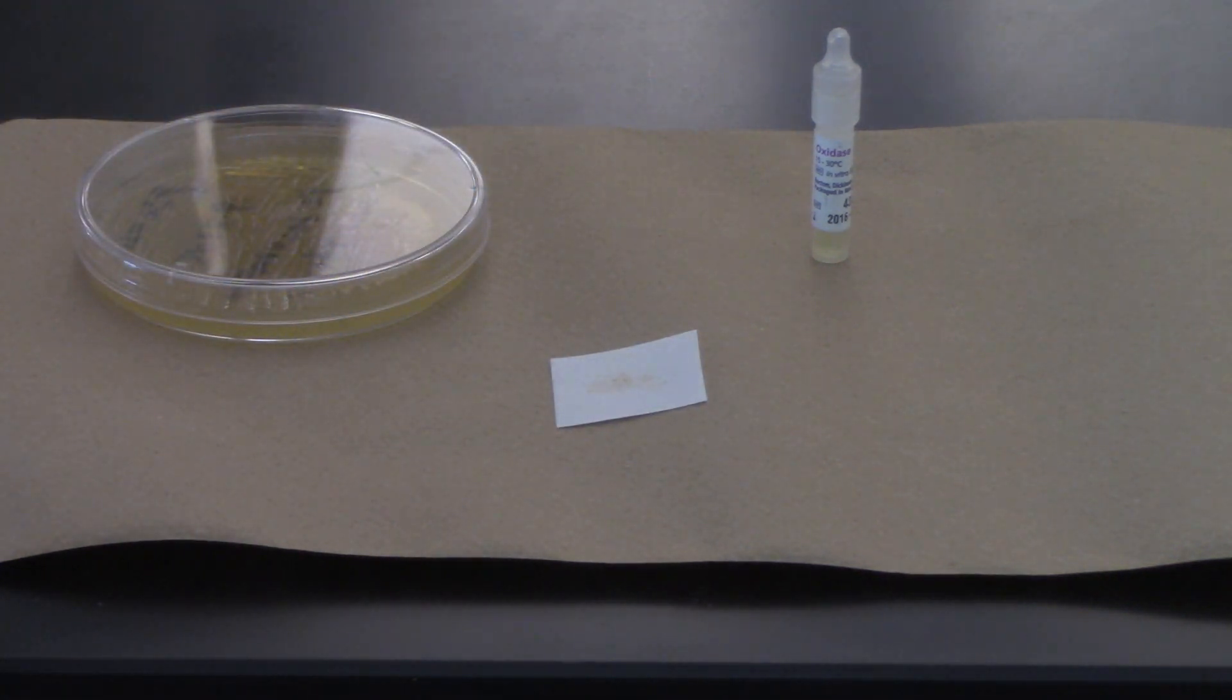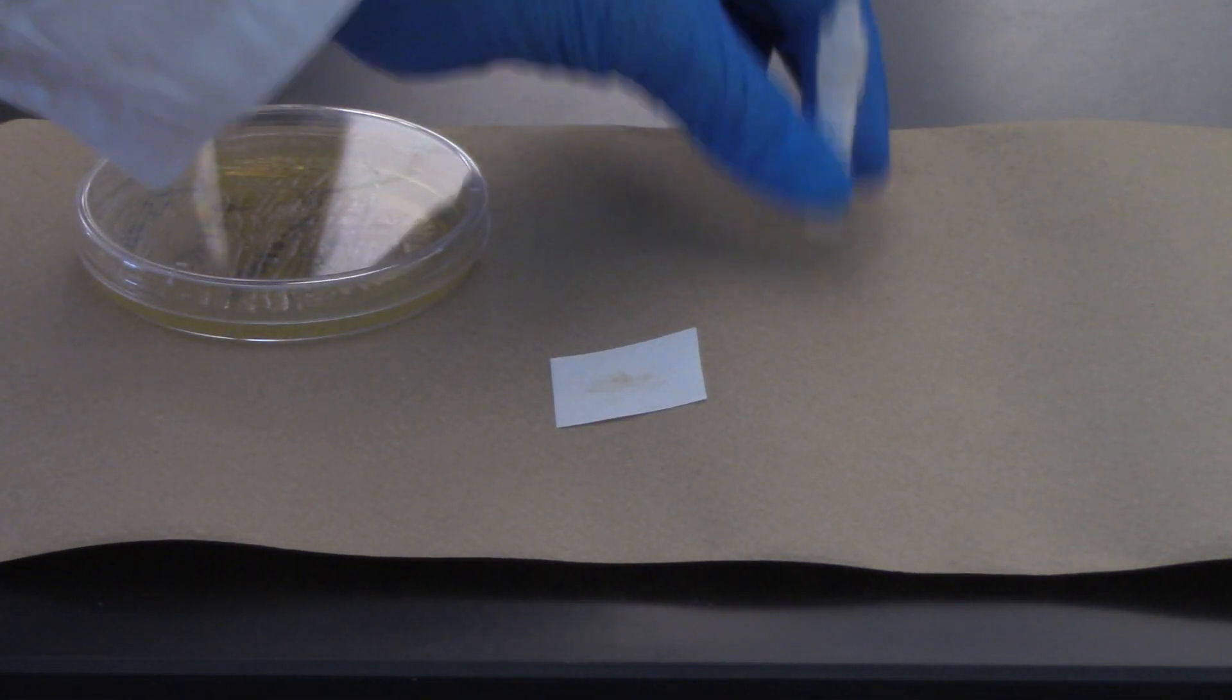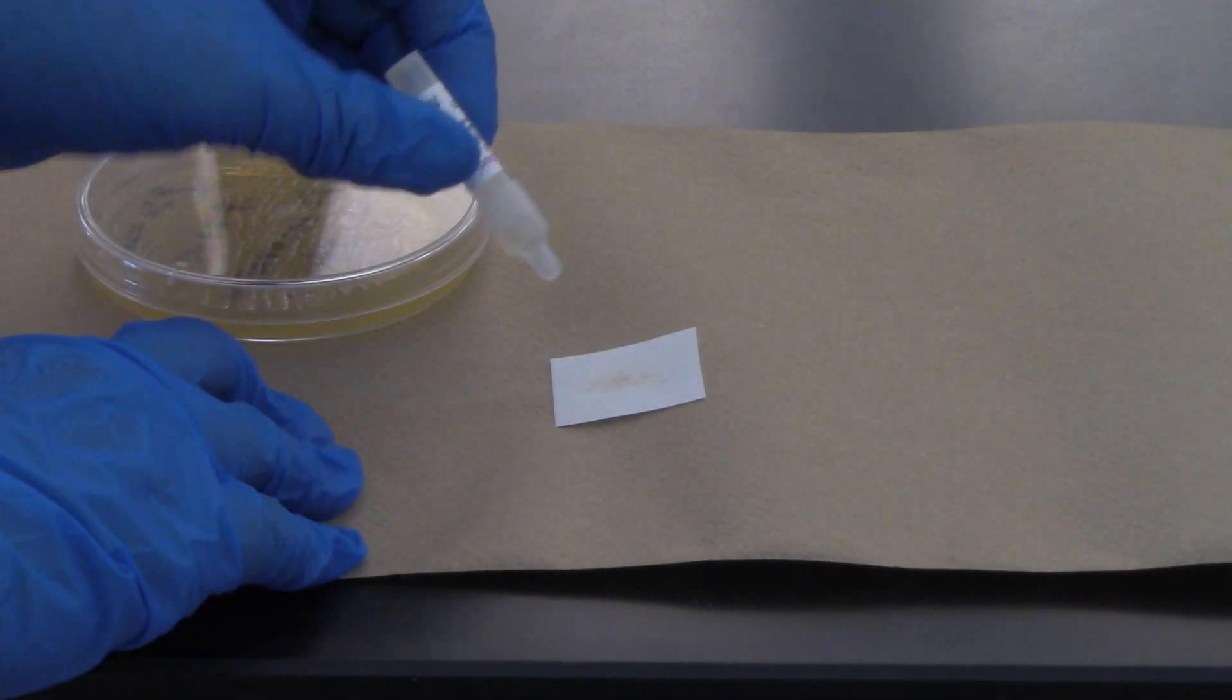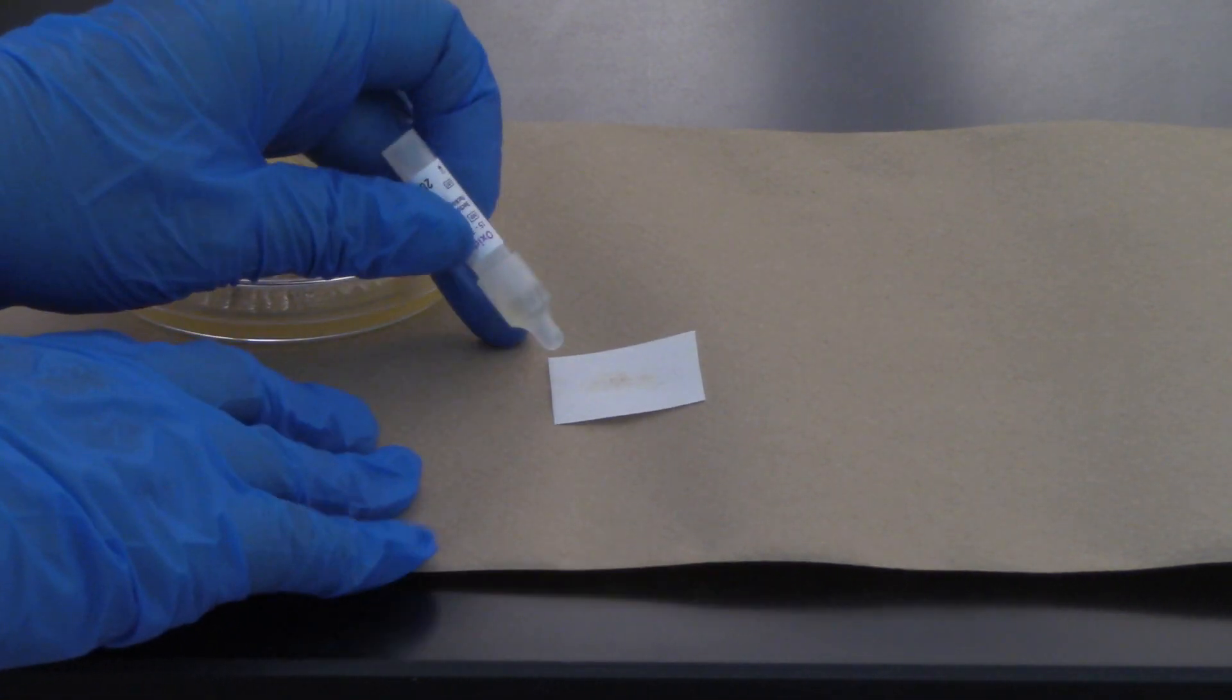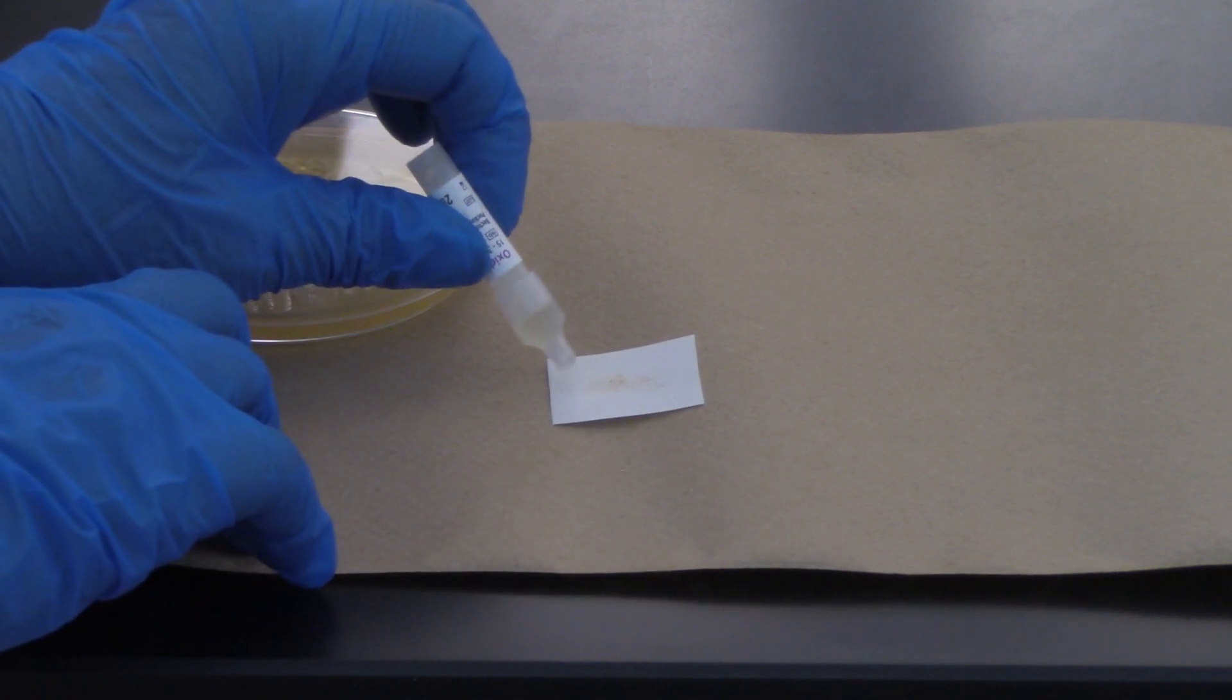Okay, that should be enough. I'm going to dispose of my dowel and add my oxidase reagent, but I'm going to add it next to where I added the culture and let it wick across the Biblius paper.